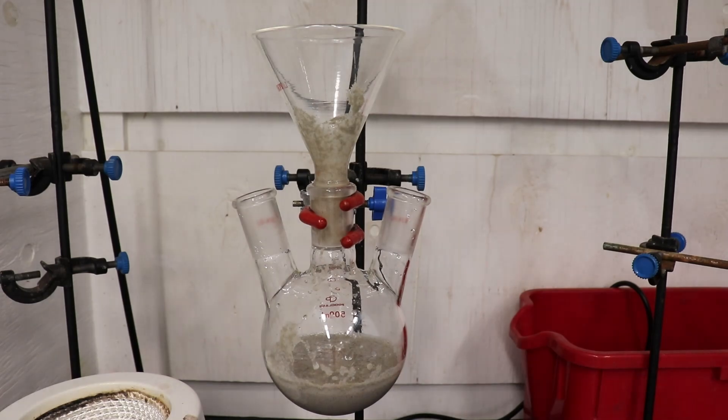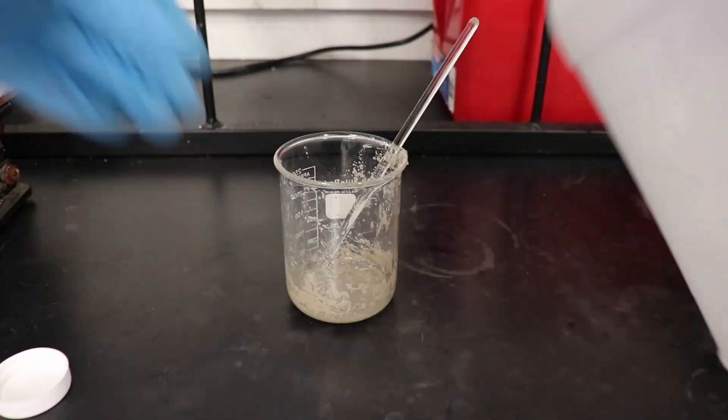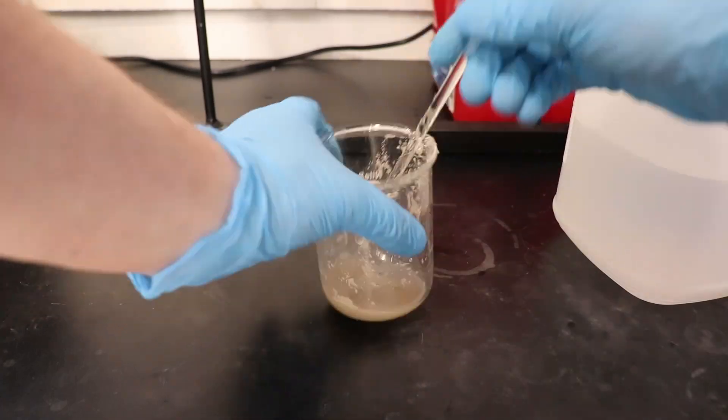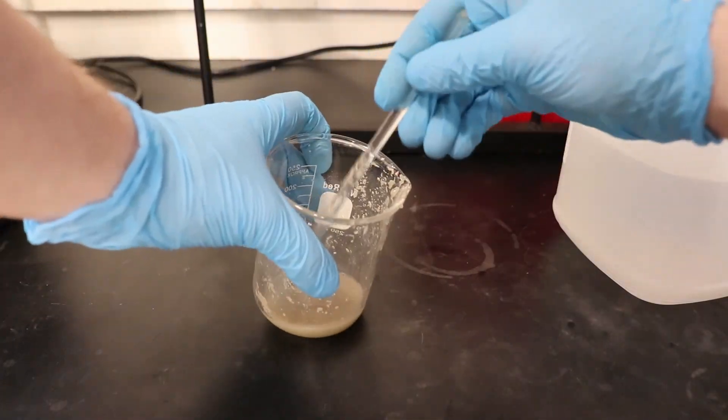The first step is to remove the nitrobenzene via steam distillation. A lot of the reaction mixture was stuck to the walls of the beaker, so I used some ethanol to dissolve it and add it to the flask.